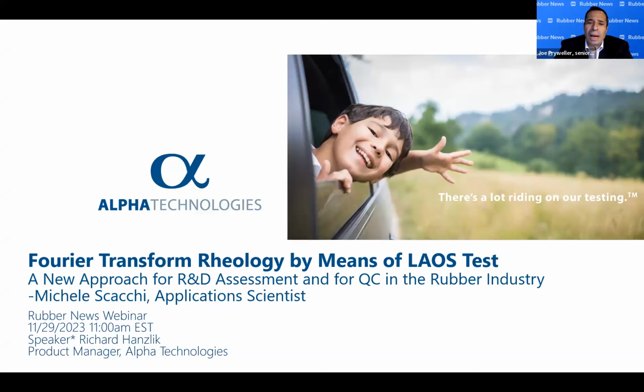This webinar will outline the FT-Rheology LAOS test method and how to use it in a rubber process analyzer. We'll provide you with case studies that help you to better understand the data and results from the LAOS method.